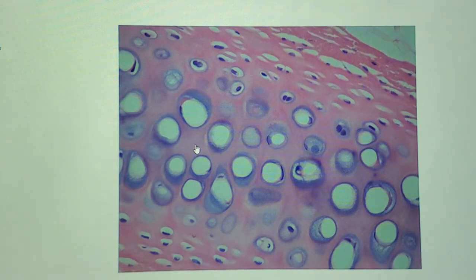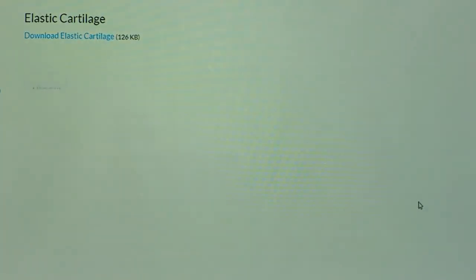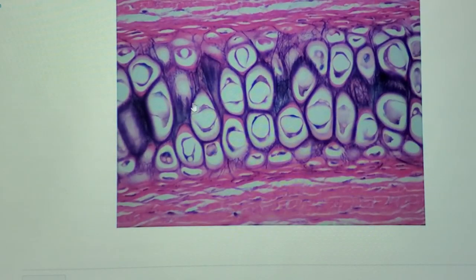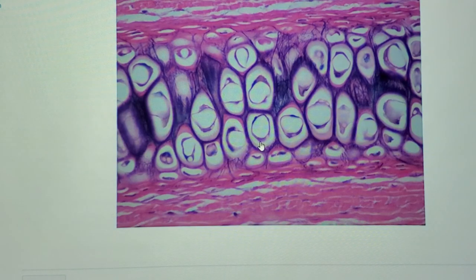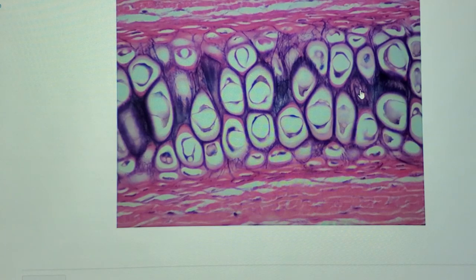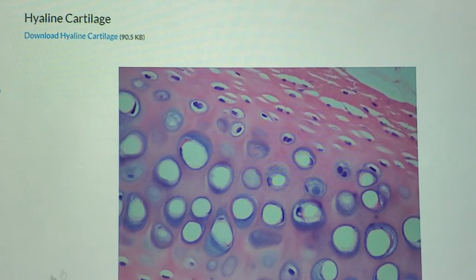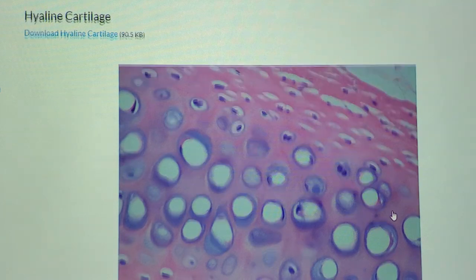Stare at hyaline cartilage for a second and notice how smooth it is — because when I switch to the next slide, you can look at the areas between the cells and see how fuzzy it looks with all those fibers. That fuzziness is your clue that you're looking at elastic cartilage — it's got a very fuzzy matrix filled with elastic fibers. You can also see the perichondrium on both sides. Same questions apply: identify the membrane (perichondrium), identify the cell (chondrocyte), identify the space surrounding the cell (lacuna). The matrix is fuzzy, so it must be elastic cartilage. Comparing the two slides makes the difference in smoothness very clear.